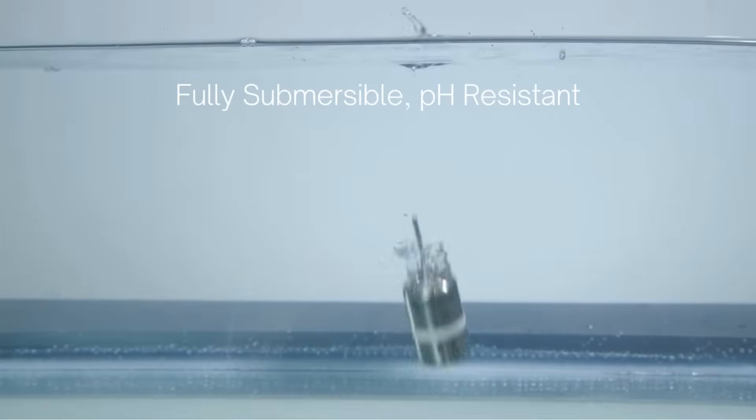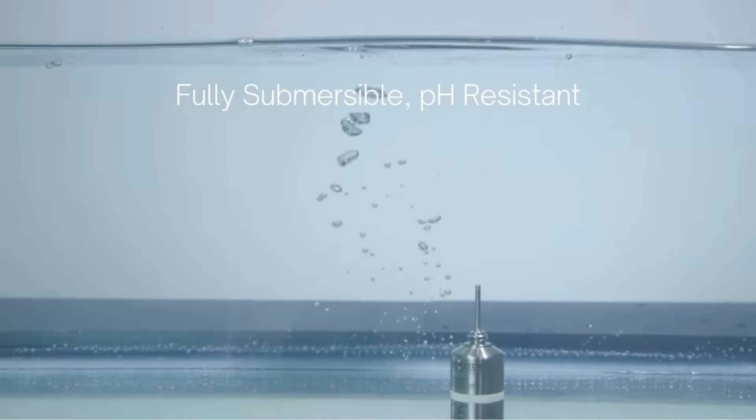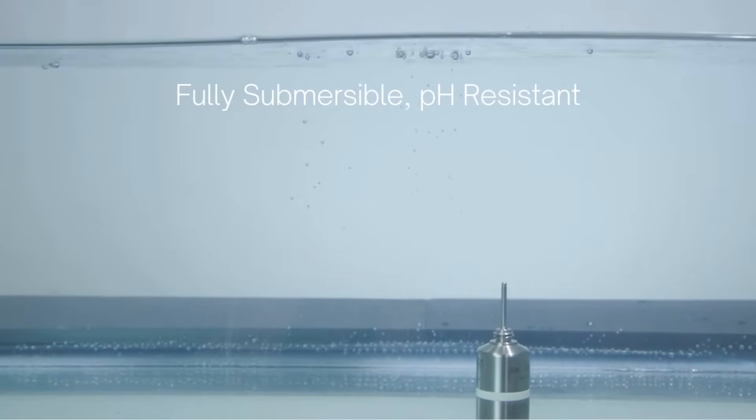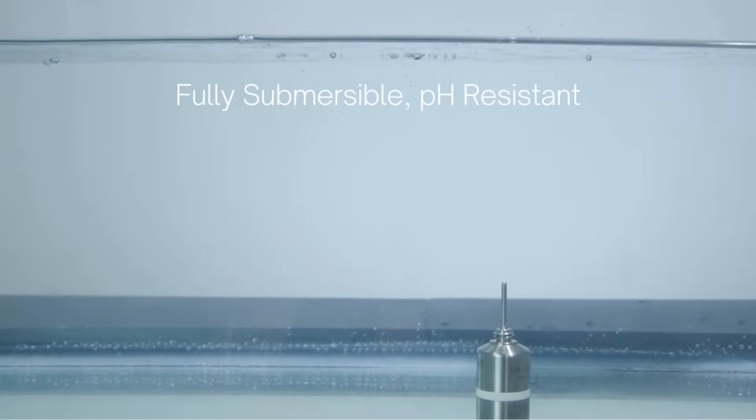Fully submersible and pH resistant down to two, the HITEMP 140-CF ensures accurate temperature monitoring up to 140 degrees Celsius, perfect for challenging conditions.